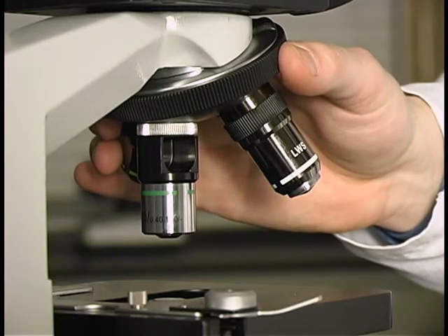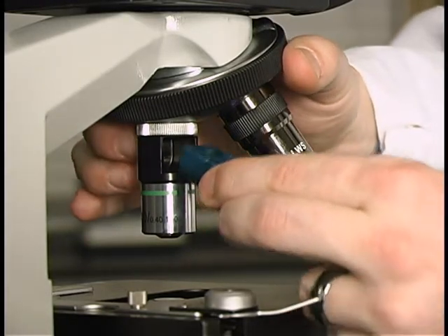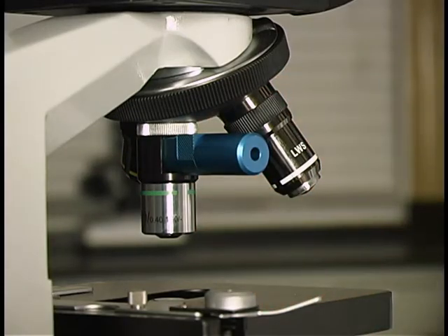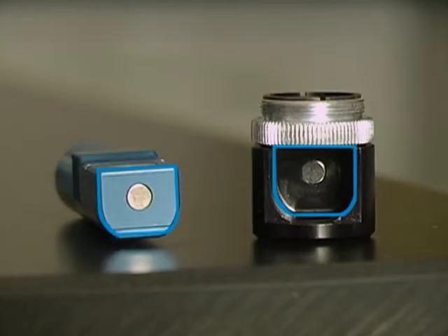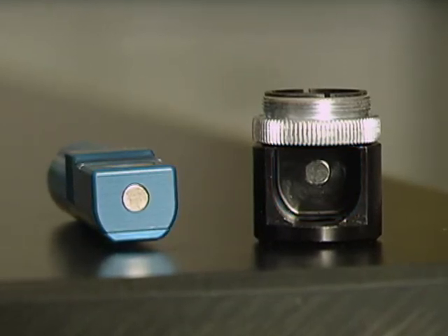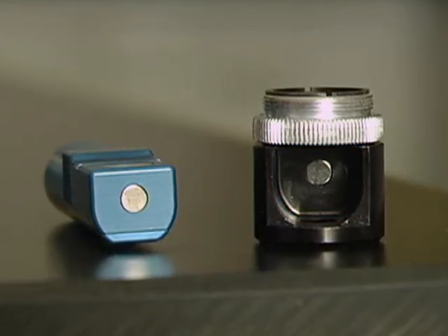Insert the filter set arm into the Paralens Advance body. To ensure that the lenses are correctly aligned, the filter set arm is designed to attach in only one configuration. Do not try to force the arm into the body as this will damage the lenses.